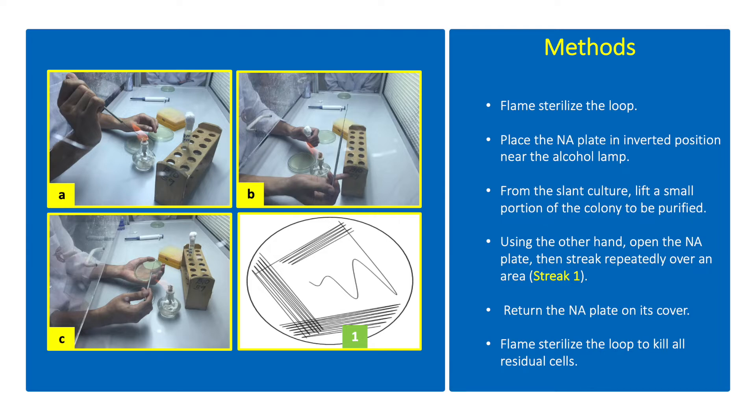Flame sterilize the loop by holding it directly above the flame. Wait until glowing red. Pass the rest of the wire over the flame twice. Cool by holding loops still close to the flame.